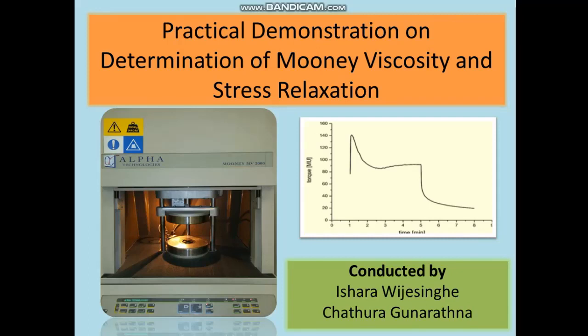Hi everybody, today I welcome you all to the practical session on the demonstration of Mooney viscosity and stress relaxation of natural rubber. Here you can see the Mooney viscometer available in the rubber technology laboratory, and using this viscometer we are going to determine the Mooney viscosity and stress relaxation properties of natural rubber.